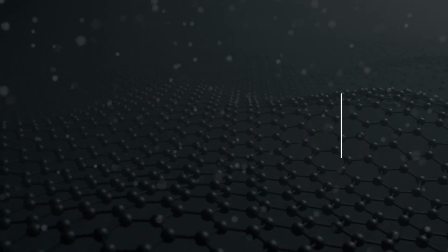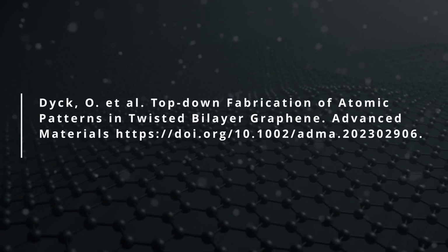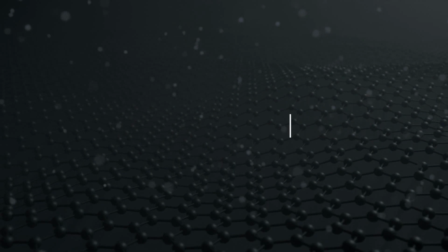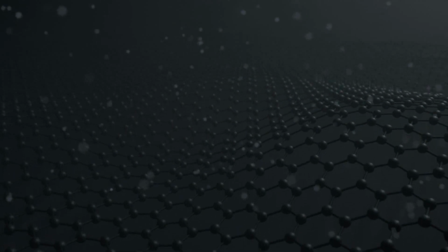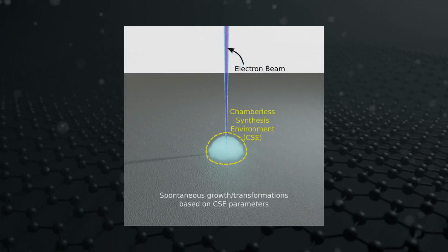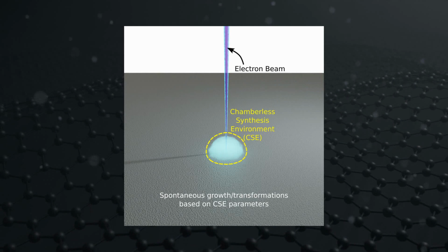In a recent article published in Advanced Materials, we put forward the idea that in-situ synthesis processes would complement and enhance atomic manipulation efforts. The material transformations observed in the STEM can be thought of as reactions within an atomic-sized reaction chamber defined by the beam sample interaction volume.